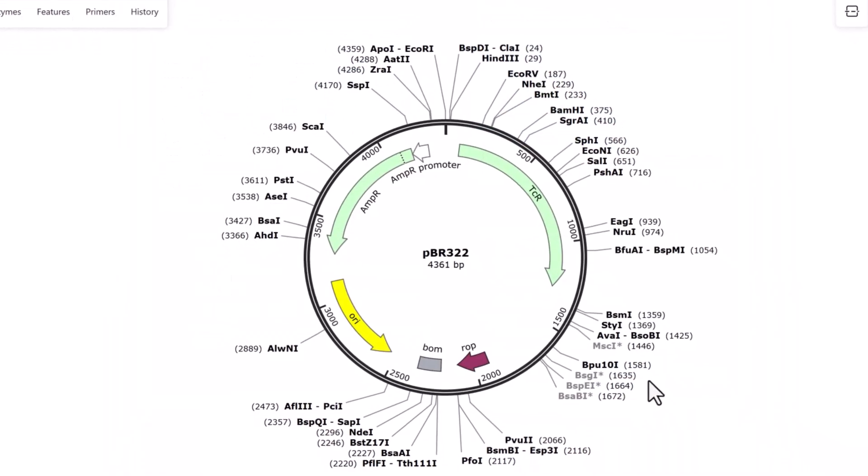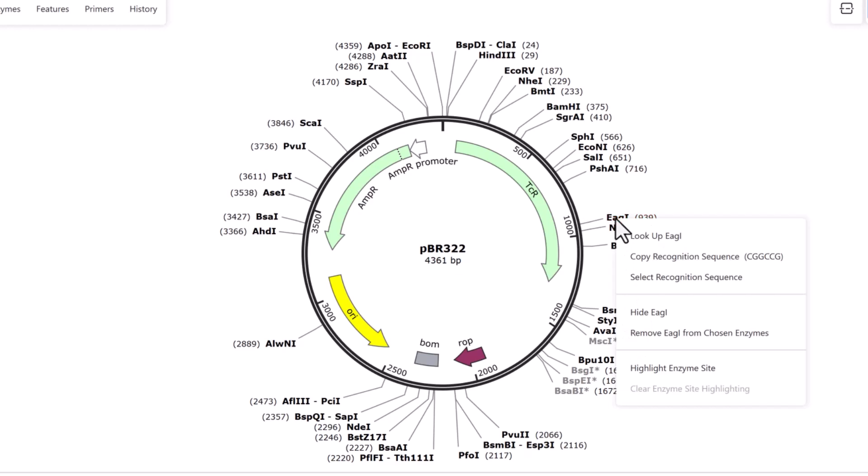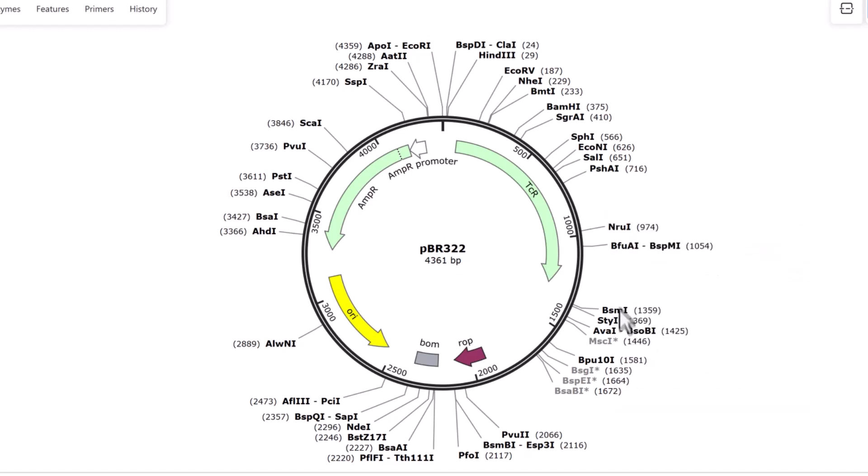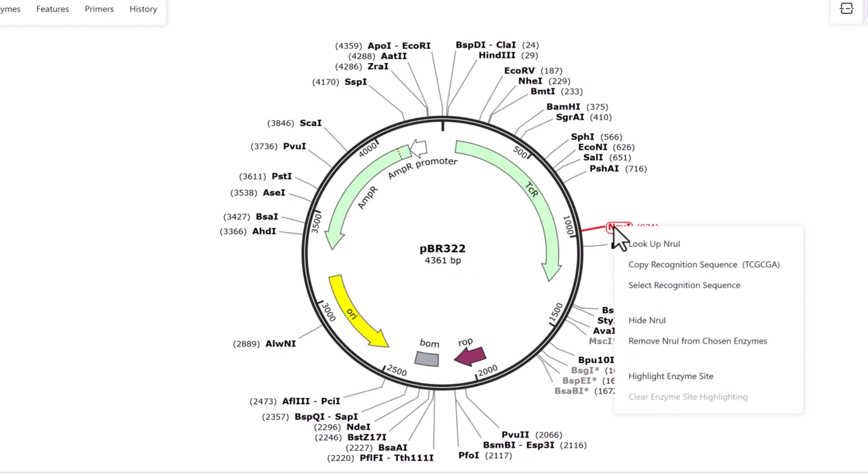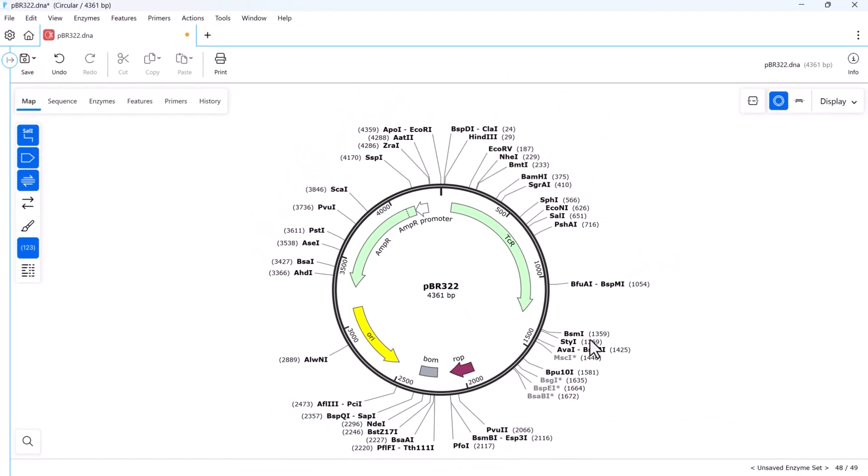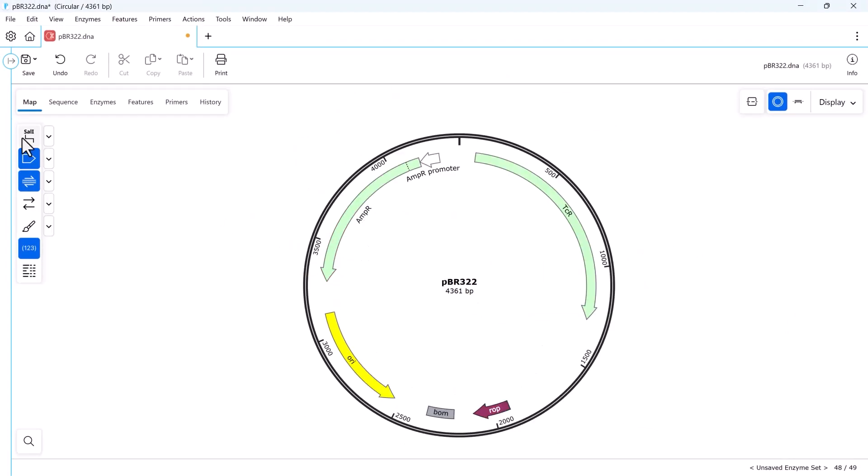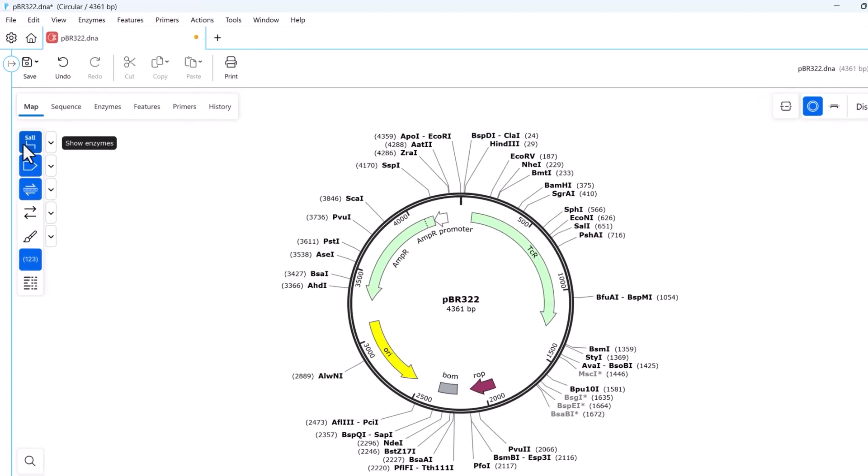Keyboard shortcuts allow you to remove enzymes directly from the plasmid map. You may want to hide some or all items without removing them. There are several ways to do this: by using the keyboard shortcut, via the hide button in the sidebar, or by selecting them via the enzyme tab.